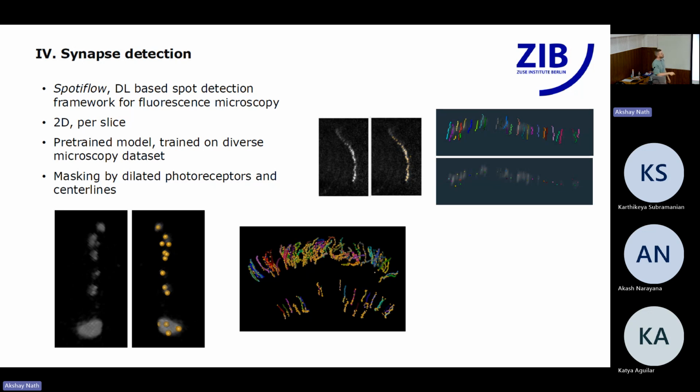Here you can see these lines representing synapses. Each different color would be one synapse. But we want to get to a point cloud like this, where one voxel represents one synapse. So how do we do this? We take the center of mass of the n brightest voxels for each of those components.